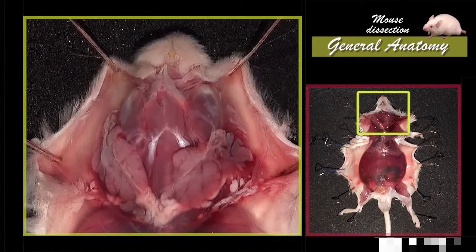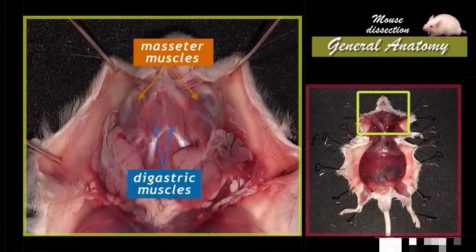In this step of the dissection, at the base of the head, we can notice a part of the salivary glands. Next to the salivary glands, the main muscles of mastication — the digastric and masseter muscles — allow the mouth to open and close.